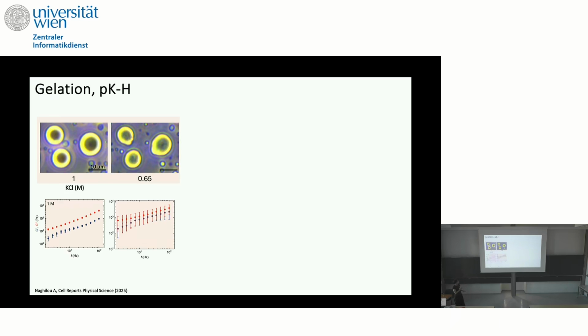And you see that morphologically, the condensates start to become more gel-like, and rheologically, they go into this very variable, weird intermediate state.